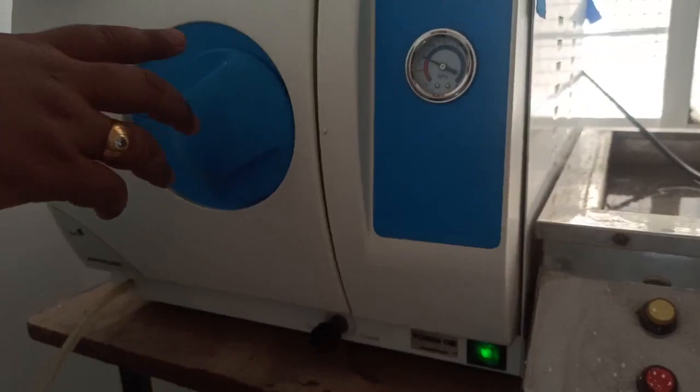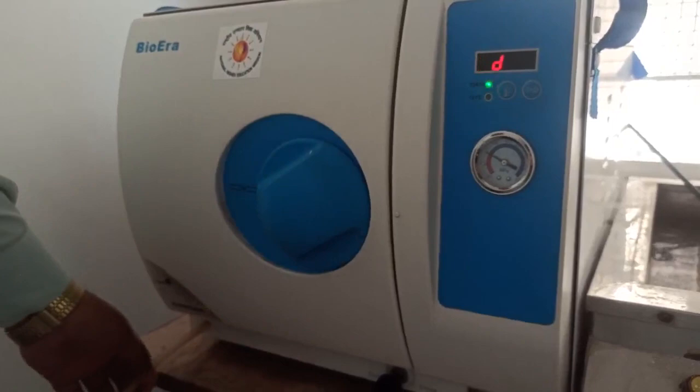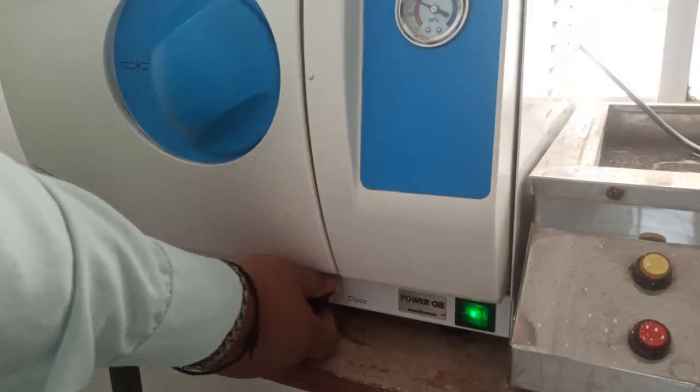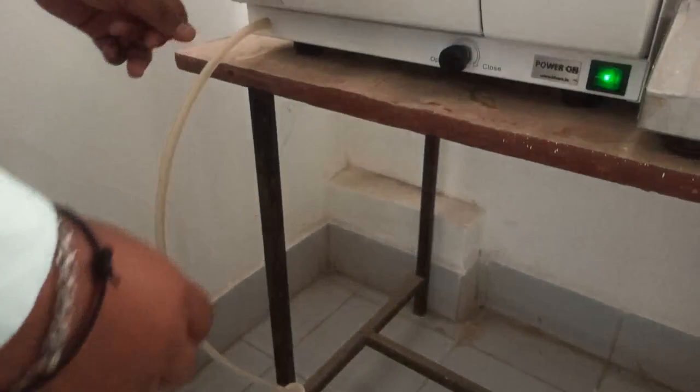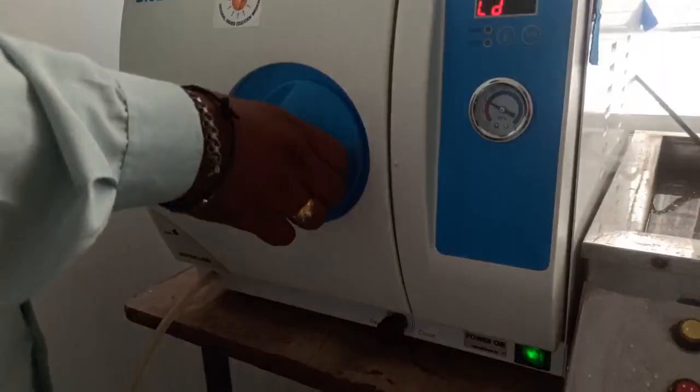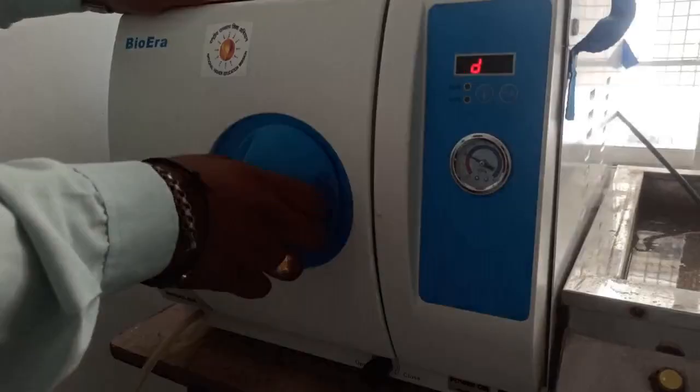The best thing about this autoclave is that whatever water you add gets out through the outlet. First of all, when you add the water you have to close this water outlet. After the autoclaving is done, the distilled water is released from the steam which is prepared inside, and then the distilled water is collected in the can below.